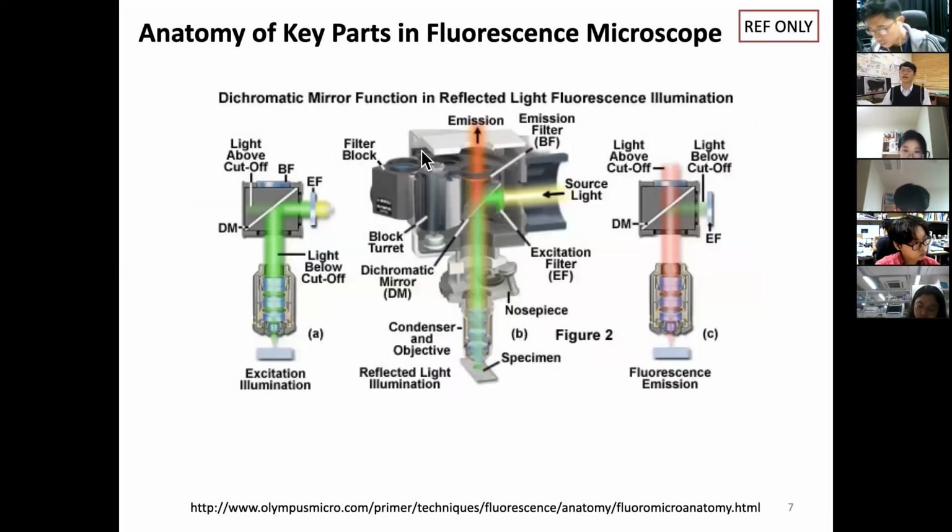Okay, so now as I explained everything, you can put your questions anytime in chat. You know, this is not an easy concept, so you can put your questions over here. Okay. So now I want to go a little bit deeper inside the anatomy of key parts in fluorescence microscope.